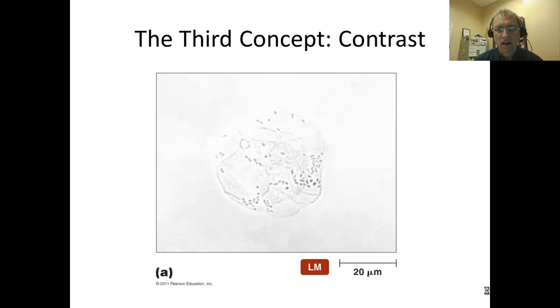through that specimen. We can add contrast to biological samples, such as this cheek cell that we see in this picture right here, by fiddling with some of the light path properties of the compound light microscope. As we saw in the last video, we can set up either dark field or phase contrast microscopy, which will allow us to see structure within cells, be able to see cells a little bit more clearly without doing anything extra to those. Within this video, we're going to talk about the property of staining, where we can add chemicals which will also increase contrast.